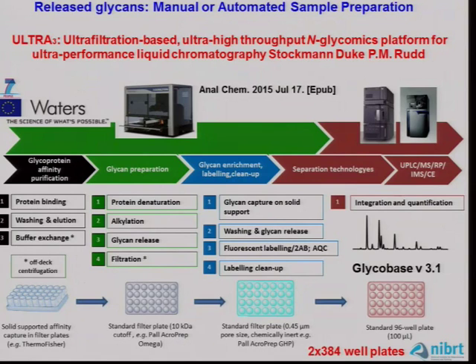But what we tried to do in my lab was to do something really simple, because when I started doing glycan analysis, it took one person 3 years to analyse the glycans on one glycoprotein. So it was a nightmare. Through various events, we tried to come up with something that any well-founded lab could do, and you didn't have to be trained for 10 years in mass spectrometry to do it. So this is what we suggest: if you've never done it before, just try this, because it will work, and then you can get more sophisticated.